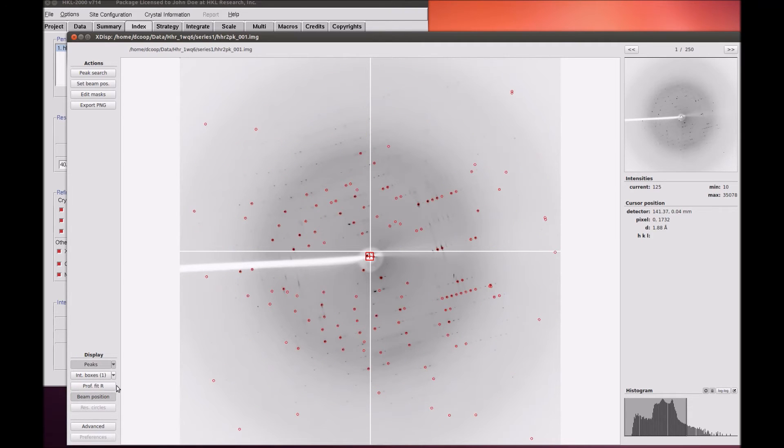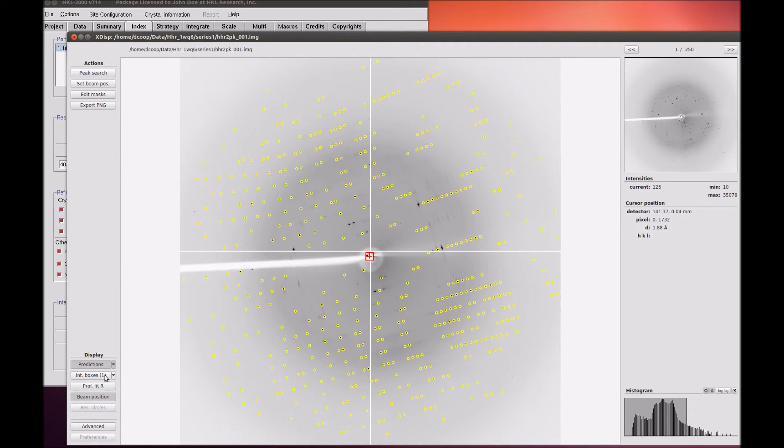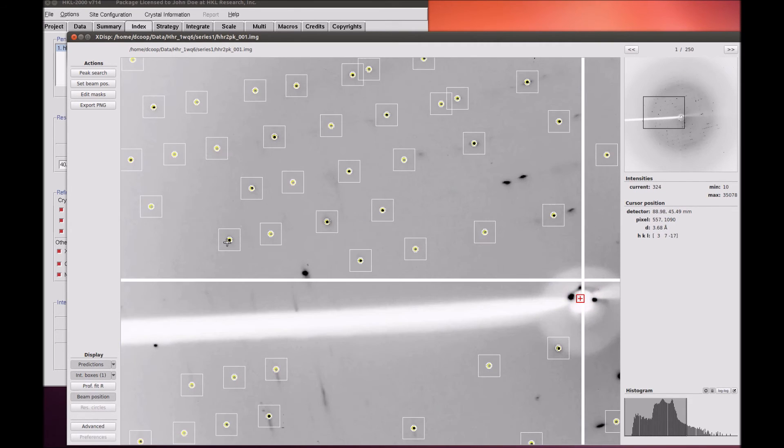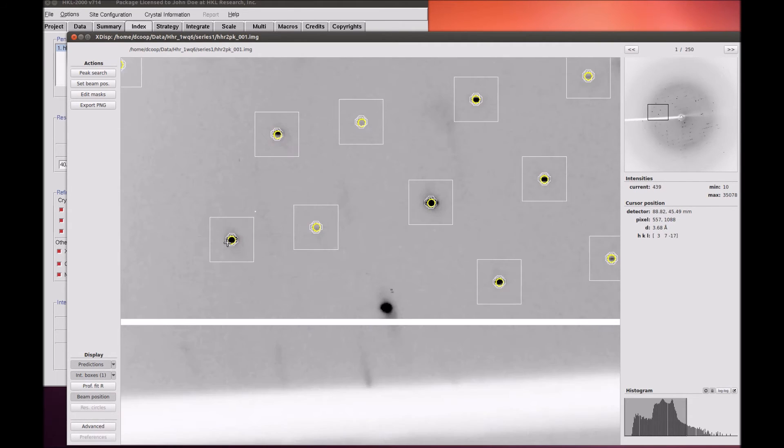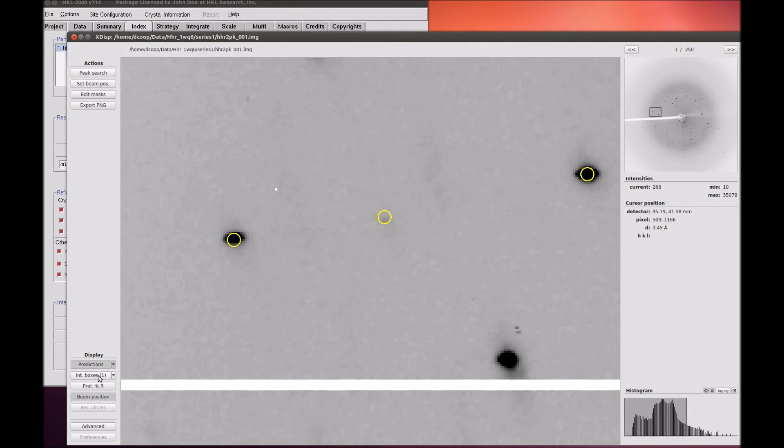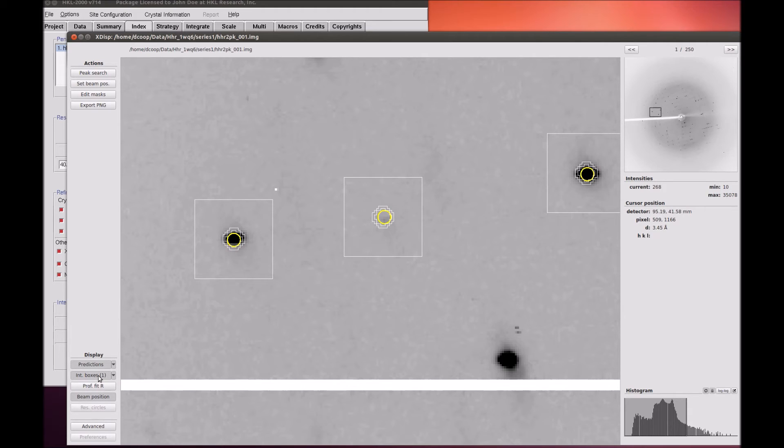Integration boxes is also a toggle that will turn on and off the boxes that show the peak and box size. These can only be seen if you are zoomed in close enough. Pixels inside the inner circle are recorded as the peak. Pixels between the two circles are the guard region and are not used. Pixels between the box edge and the outer circle are used to calculate the background for the reflection.